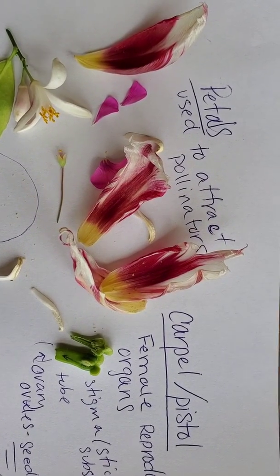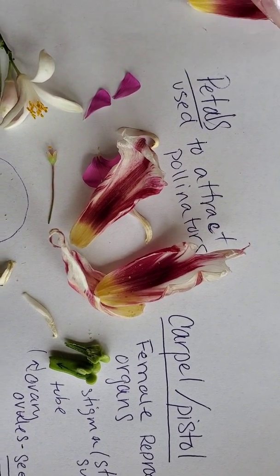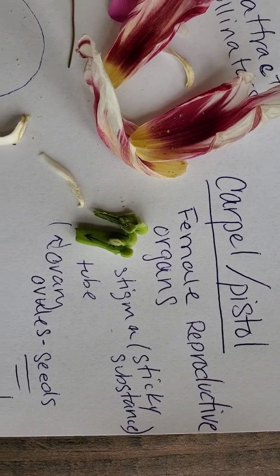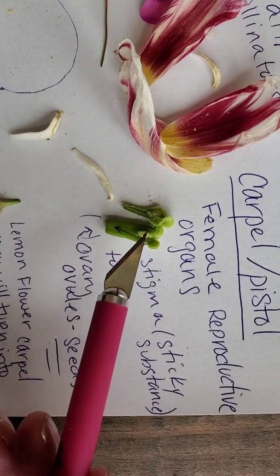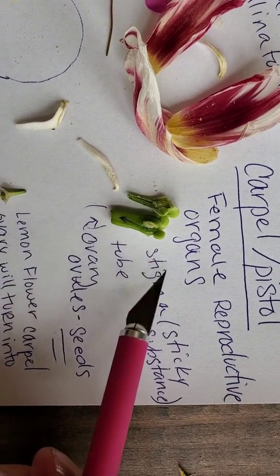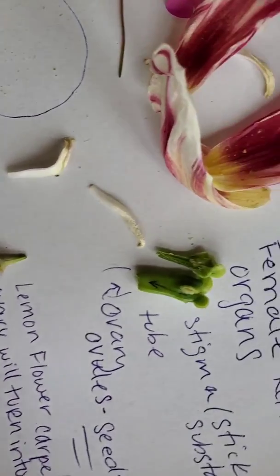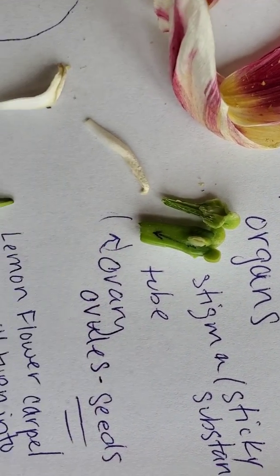Here's one that I worked on earlier with the tulip. So you've got the petals, which are used to attract pollinators, as well as scent. Here again, these are the carpel, female reproductive organs. And this one, the stigma looks a little bit different than it did on the columbine. So you've got your stigma, and you're going to have that tube, that style, and then the ovary will be housed down here. Then you can actually see, I think the ovules are right there.